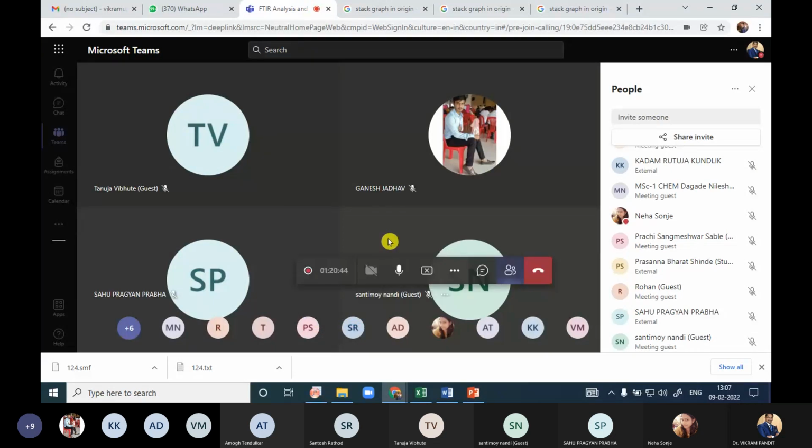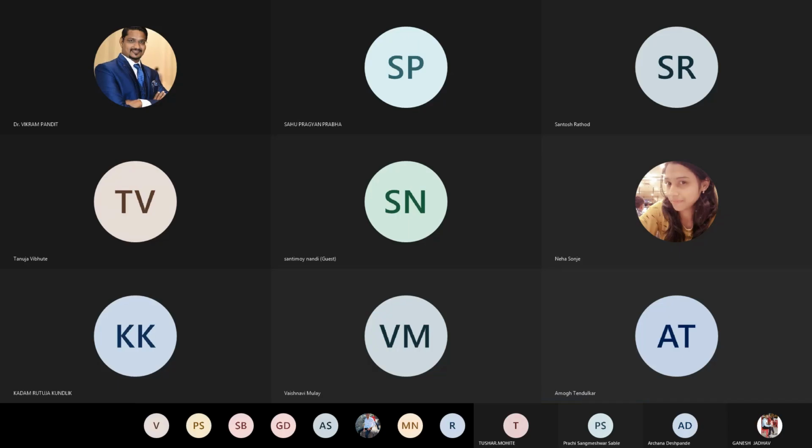Okay, now, yeah, that much part I want to show you from this presentation.